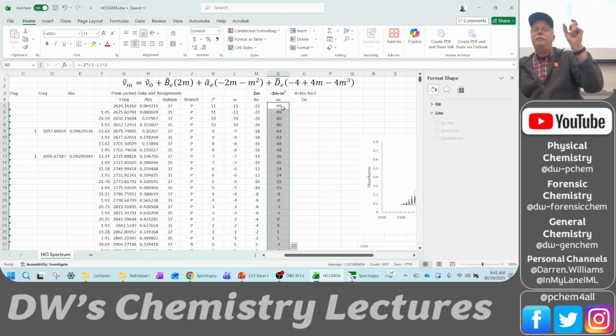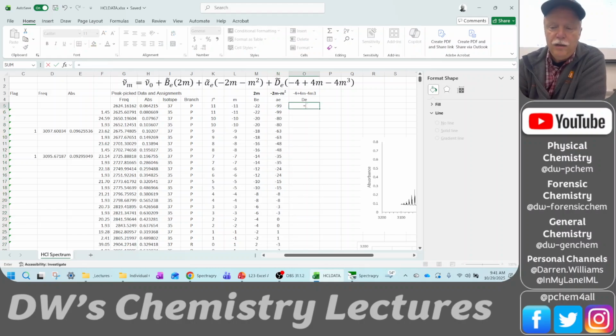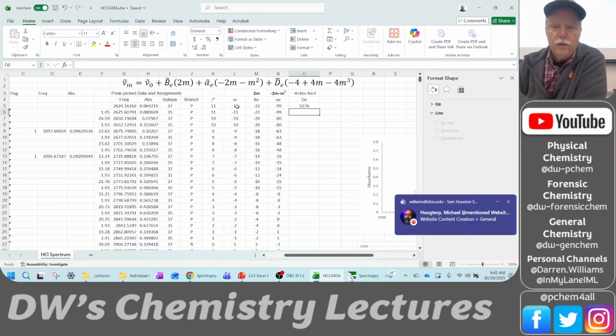If you do this the other way, sometimes Excel makes some mistakes. Like if you start with minus M squared minus 2M, you'll get positive values sometimes, because it'll put the minus M in, it'll square both. It'll do minus M first and then square it. And so I found it works more reliably if you do the square or the cube last. Okay, and then minus 4 plus 4 times M. Be sure you click the right cell. Minus 4 times M raised to the 3rd power.